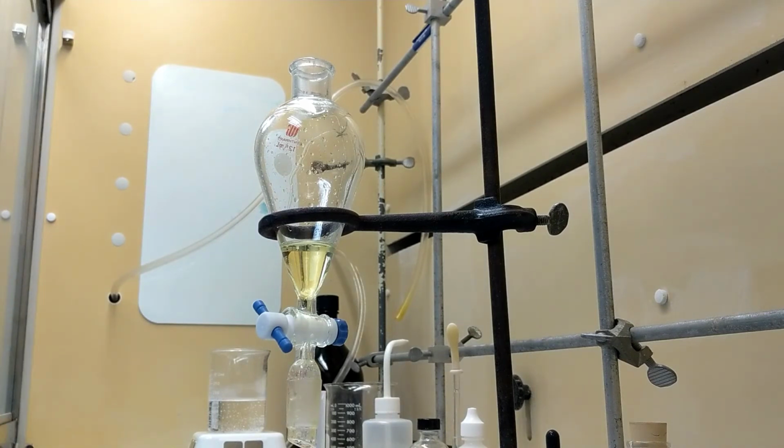So I'll get back to you guys after the ether starts drying.